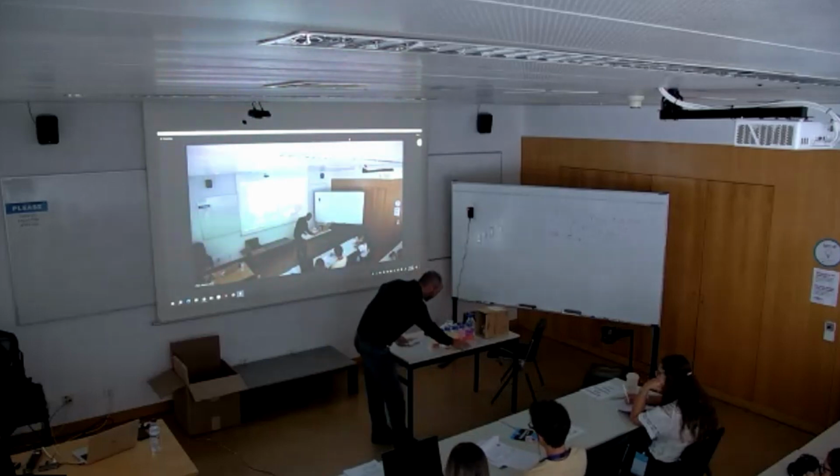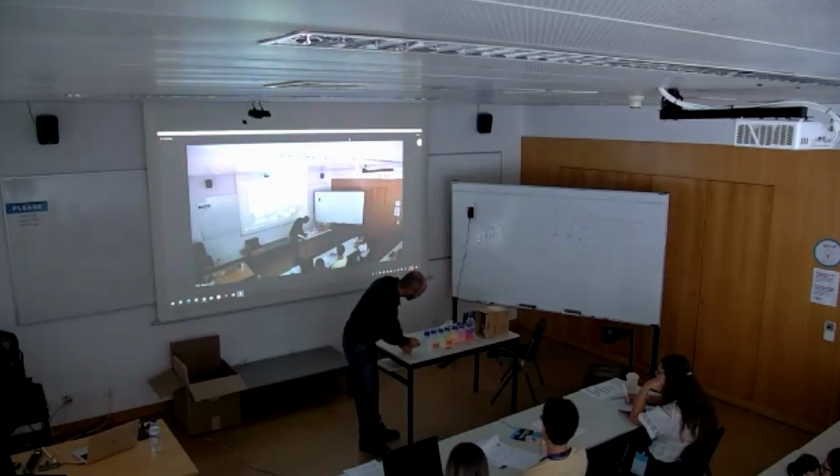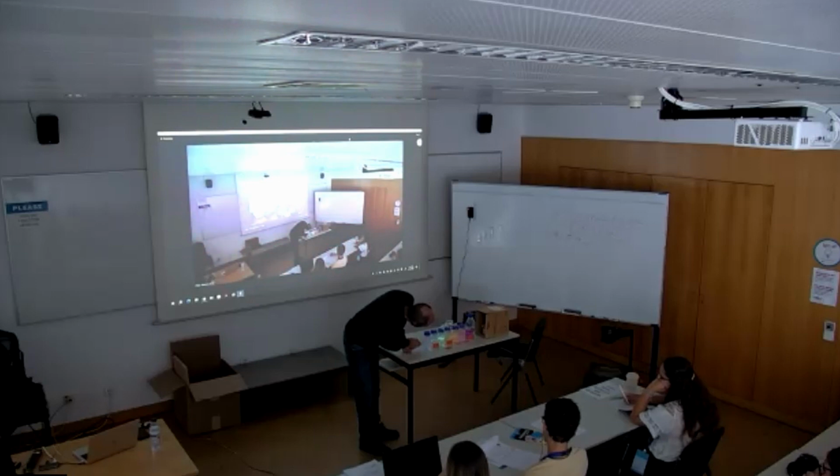Okay, doesn't matter. This is the 488. It's very important. Okay, and we have water there. And if I use the 405 light, what happens is that we see the excitation of all the liquids until the very end. Do you see that there is light even from the 600 nanometers excitable fluorophore?